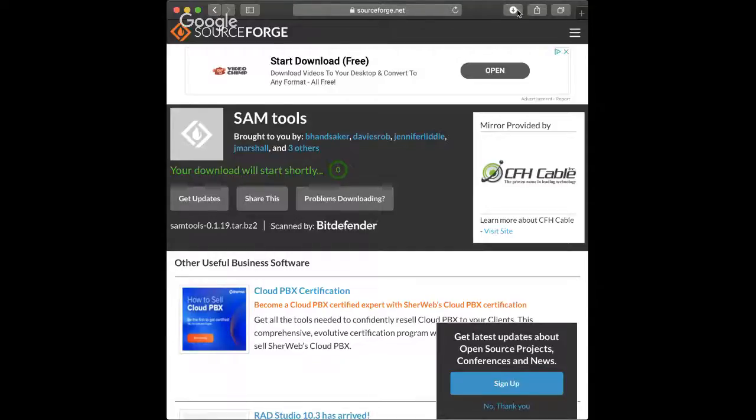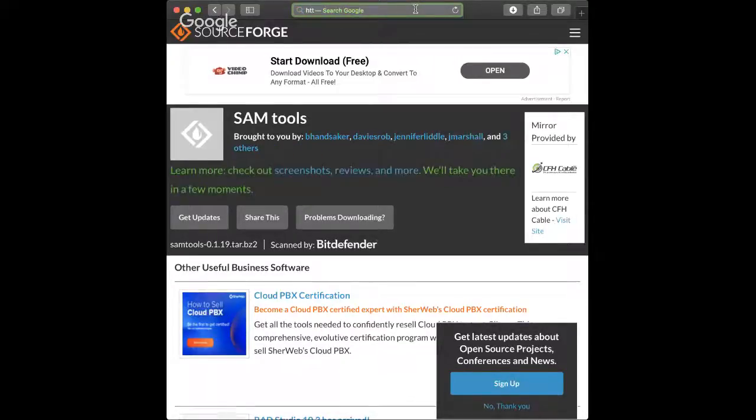So if you check, we've got, okay, cool. So now the last thing that we'll need will be StringTie. So I'm going to go there.